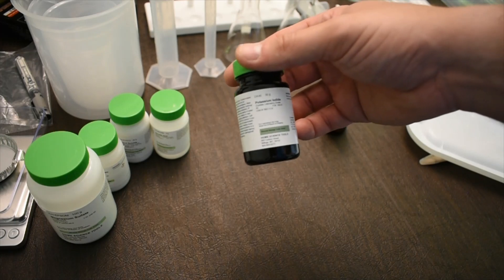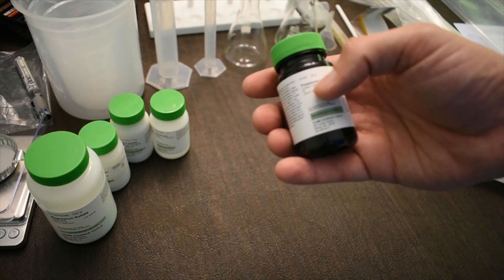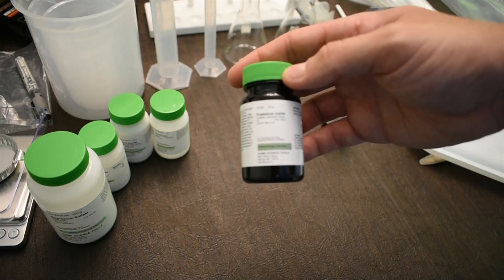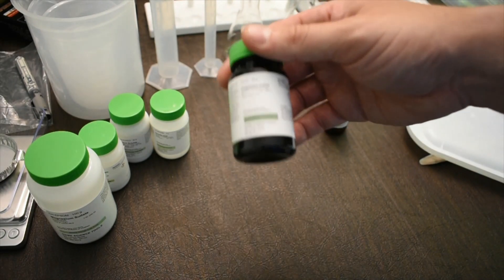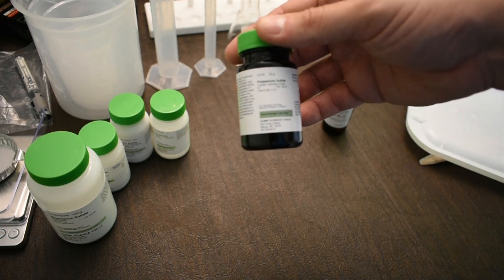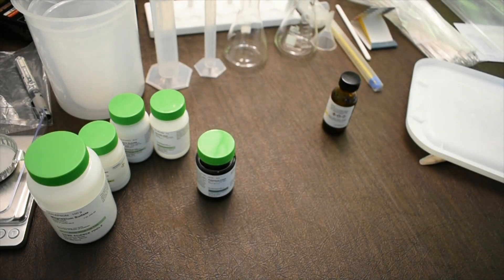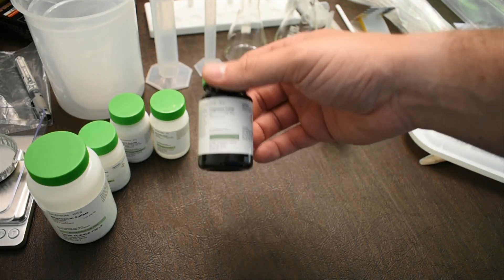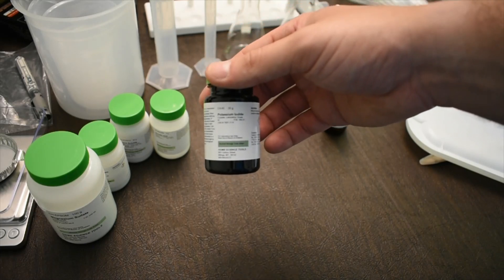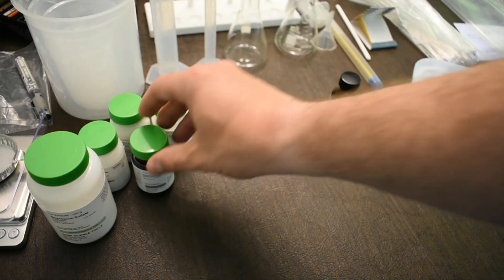Potassium iodide has a potassium cation and an iodide anion. It's not something you want to ingest. Wear safety glasses because it's an eye irritant. If you get potassium iodide on your skin, wash your hands with soap and water. For spills of the solid, use a wet paper towel to pick up the solid and wipe away any residue.